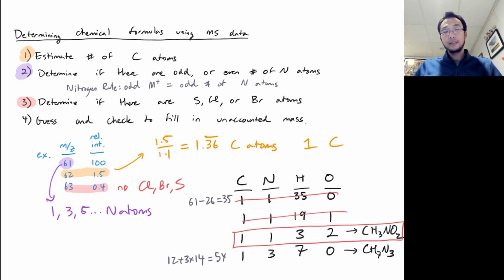So hopefully that gives you a sense of how mass spectrometry works, how the data is collected, interpreted, and then finally how to use mass spec data to try to arrive at a chemical formula.